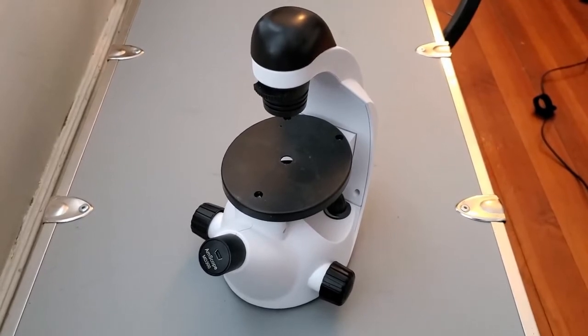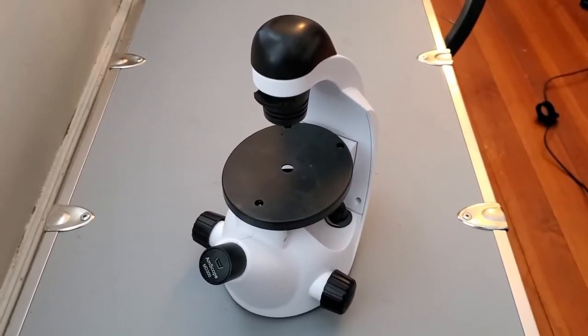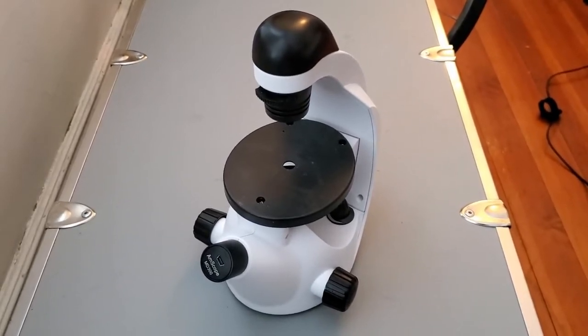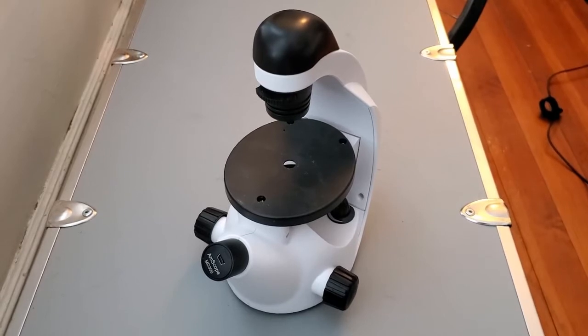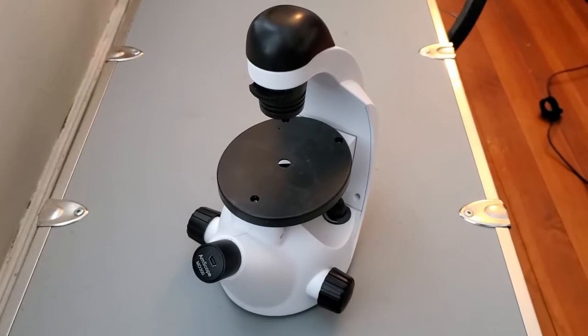This is probably the most basic model that you can get off of Amazon. It's probably about fifty dollars for the actual microscope part and then another fifty or so for the USB camera. I'm just going over the basic operations here.